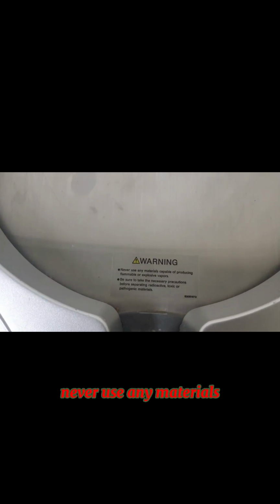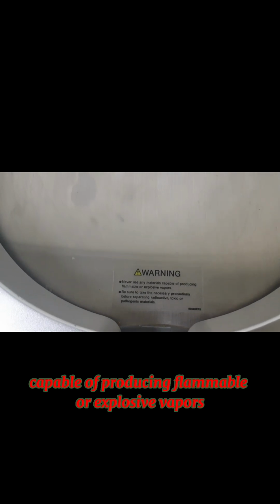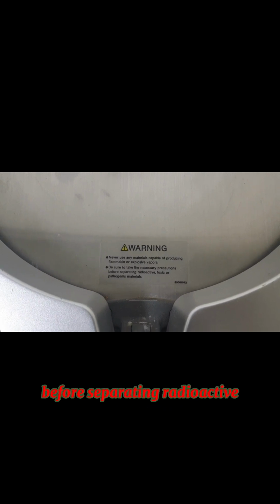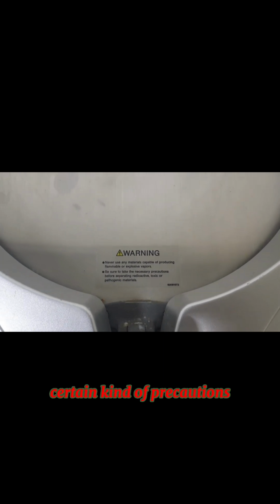Now there are also certain precautions that you need to take. Never use any materials capable of producing flammable or explosive vapors, and be sure to take the necessary precautions before separating radioactive, toxic or pathogenic materials. So we have to take care of these kinds of precautions.